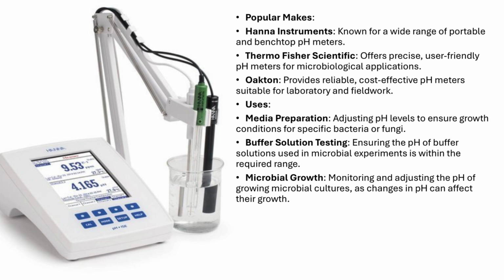In conclusion, a pH meter is a critical tool in microbiology labs, helping researchers measure and adjust the pH of solutions, culture media, and microbial cultures. Whether you're preparing media or testing field samples, a pH meter ensures that the right conditions are maintained for microbial growth.